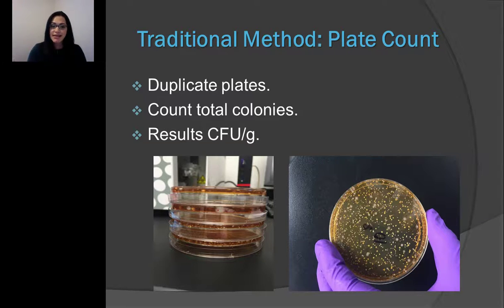And as you can see, these plates are really, really covered in colonies, and sometimes it's really tricky, and it can be challenging as well to count all these colonies and report a result in a timely manner when you have, let's say, 20 or 30 samples in one day. As you can see, this is really, really time consuming.